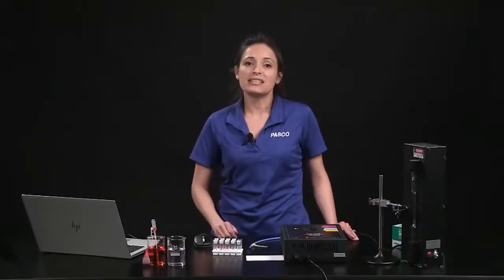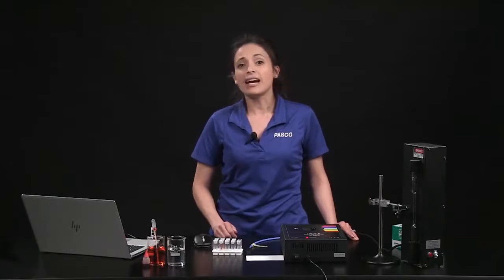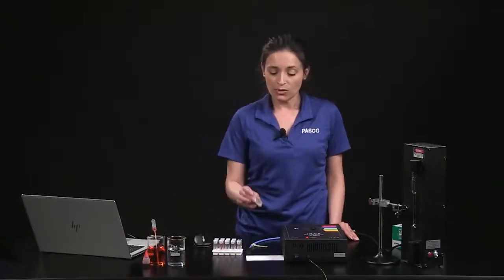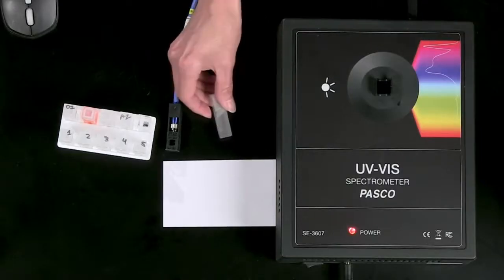These cuvettes are made of plastic. If you need high chemical resistance or need to investigate solutions at wavelengths below 220 nanometers, you can order the optional quartz cuvettes that are sold separately.